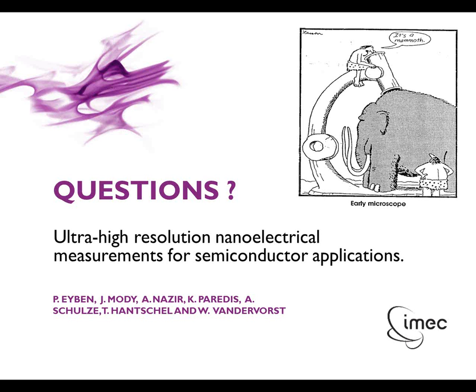So we need to be careful about our force and cantilever selections to operate in low force mode, or preferably use an alternative to contact mode like this peak force TUNA mode, which allows us to control that normal force to much lower forces and eliminate the lateral force. And when using that, there will be no lateral dragging of the sample.